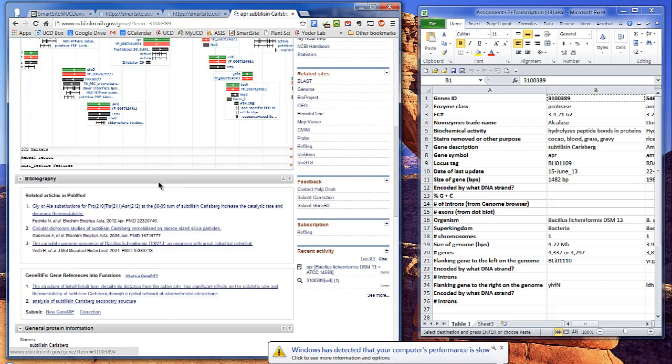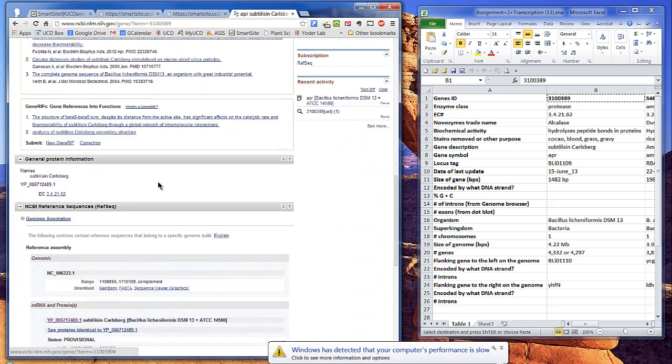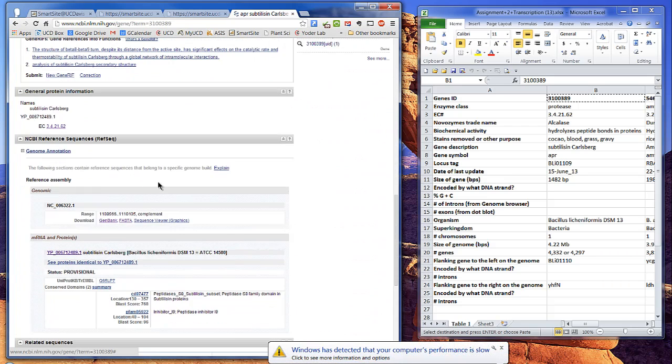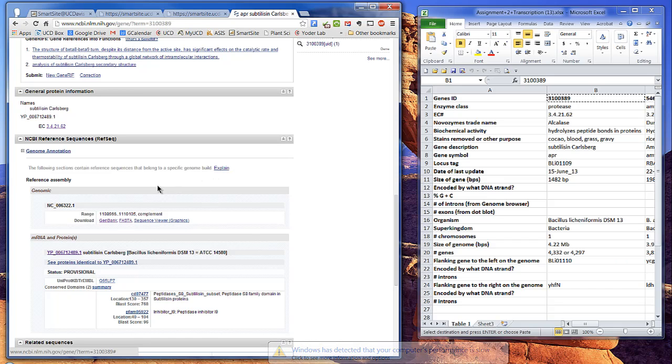Scroll down to the NCBI Reference Sequence section, and in the section called Genomic, click on the GenBank.